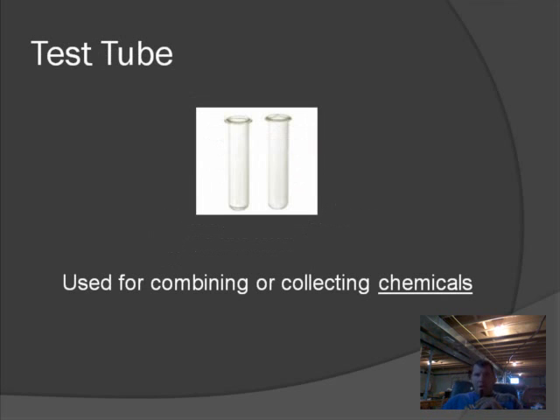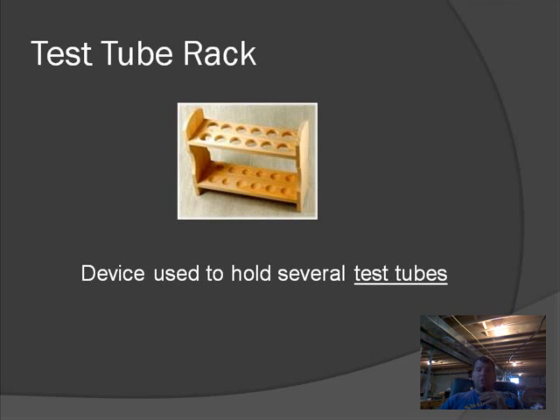Everybody's probably familiar with test tubes. Ours are glass, so you've got to be careful handling them. Test tubes are used for holding chemicals — pretty simple devices. Along with test tubes, you need to use a test tube rack. These are wooden racks with holes the size for test tubes, which holds them in place. Test tubes have a round bottom so they can't stand by themselves; you need the test tube rack to hold them during your experiment.